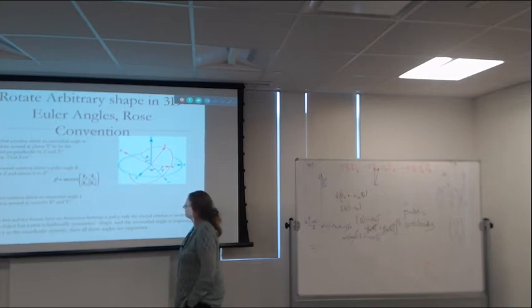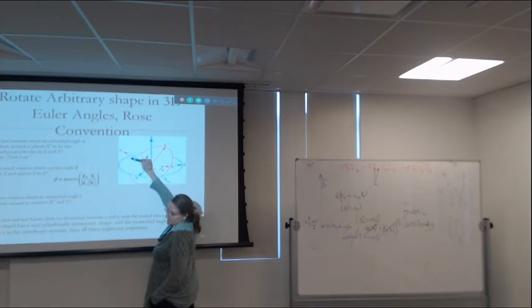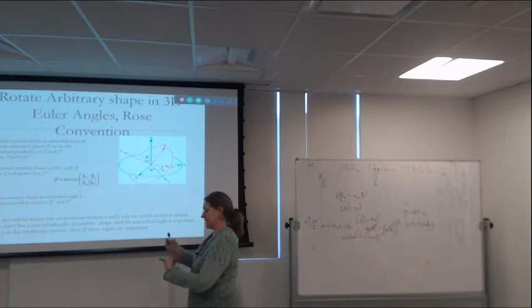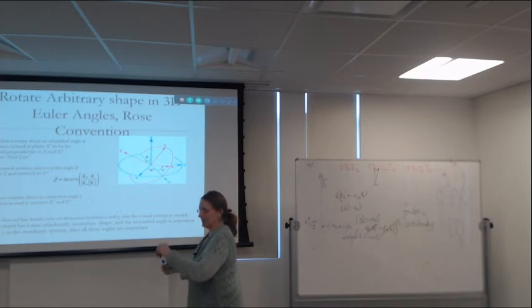We'll come up with an example where it does. So I've gotten z where I want it, and now I may need to twirl the x and y axes around until they're perfect. So it's three angles. So one is azimuthal to set up the central rotation, which is polar, and then another rotation around z.